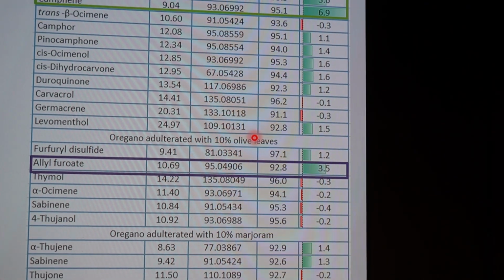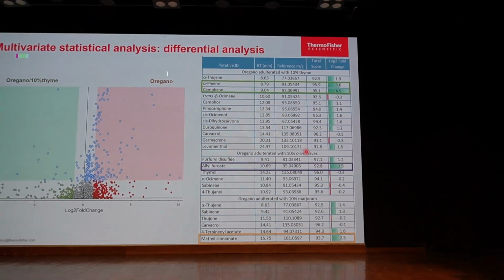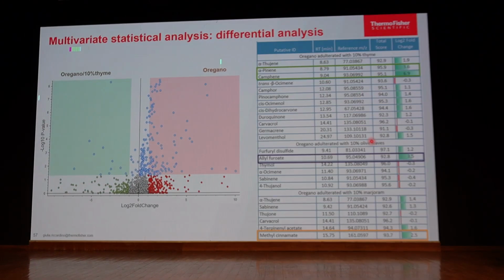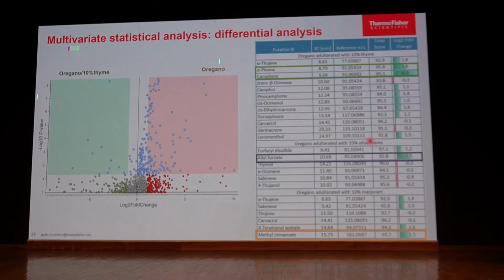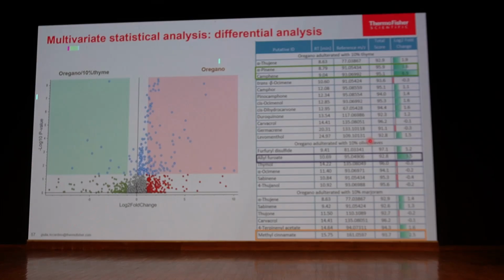matrix-wise selected marker compounds, which tomorrow you can also set up where you want to do that target-oriented analysis. So these compounds you can monitor in either single quad or triple quad also, but you will get information only related to these 3 compounds, whereas in HRMS you can get additional information.